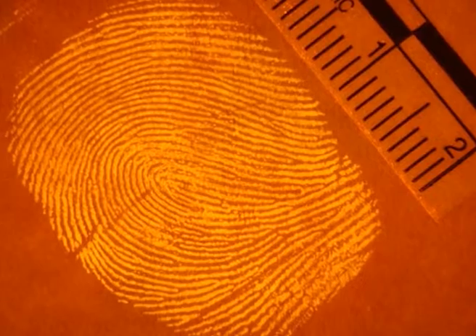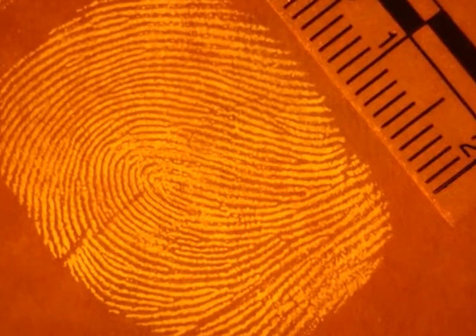The surface to be examined is baked in an oven at 100 degrees centigrade for about 30 minutes. It is then immersed successively in solution A and B. Finally, it is washed with solution C. The surface is allowed to dry naturally, whereupon the fingerprints are rendered visible.